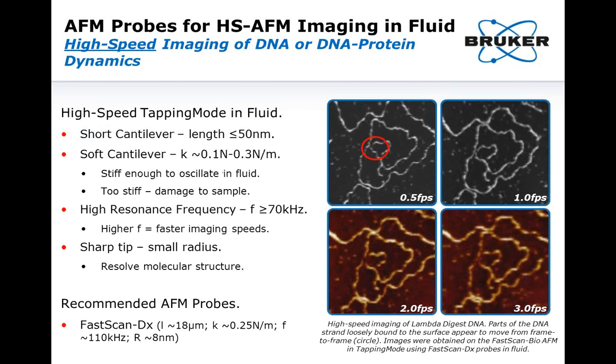Next, we have an example of high-speed imaging in fluid of lambda digest DNA. Parts of the DNA are loosely bound to the surface and move from frame to frame. Examples from 1/2 frame per second to 3 frames per second are shown.